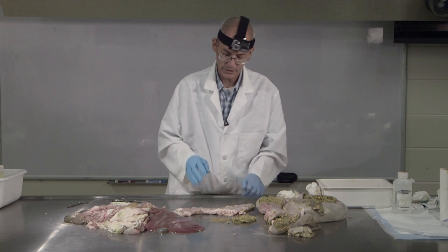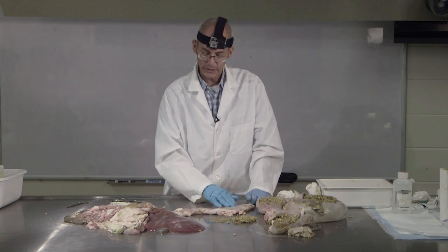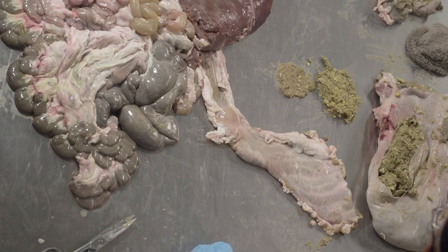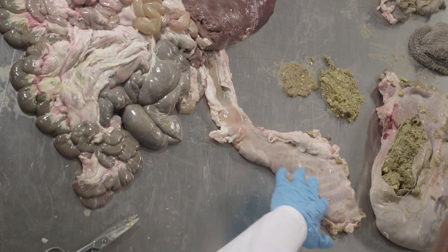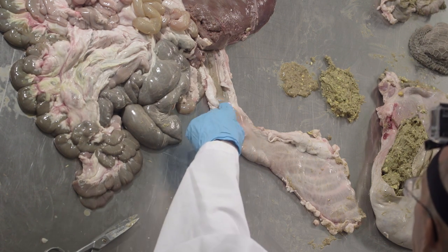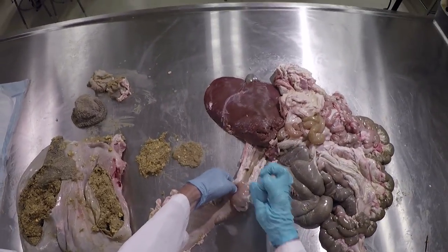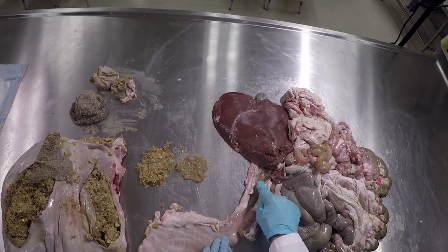So as I mentioned before, this is the secretory portion of the stomach. This is where pepsin and hydrochloric acid are added to the digesta. And so breakdown of any food material that's passing down and any microbes that pass down begins here. There is the pyloric sphincter. You can see it very nicely, there's kind of a constriction here, a knob here. That's a valve that restricts the flow of food material down into the small intestine.